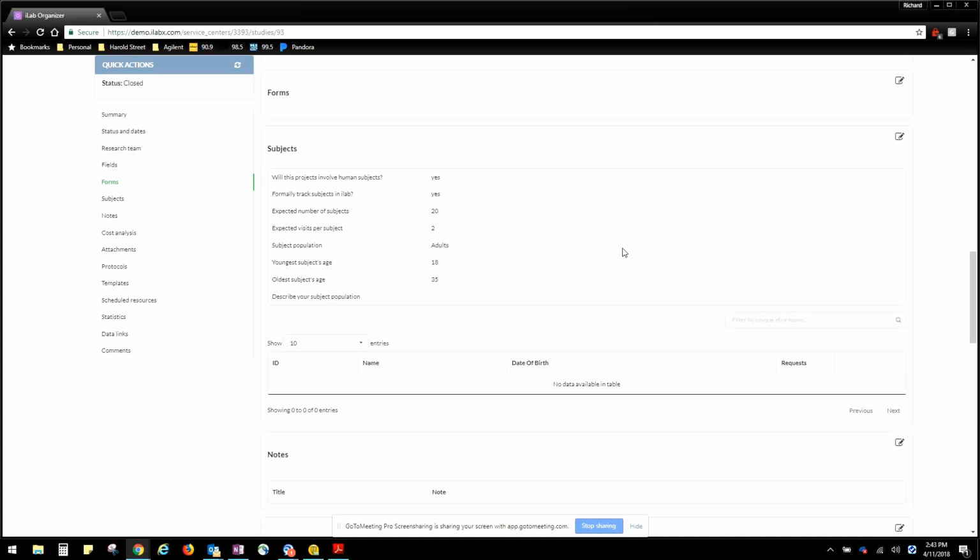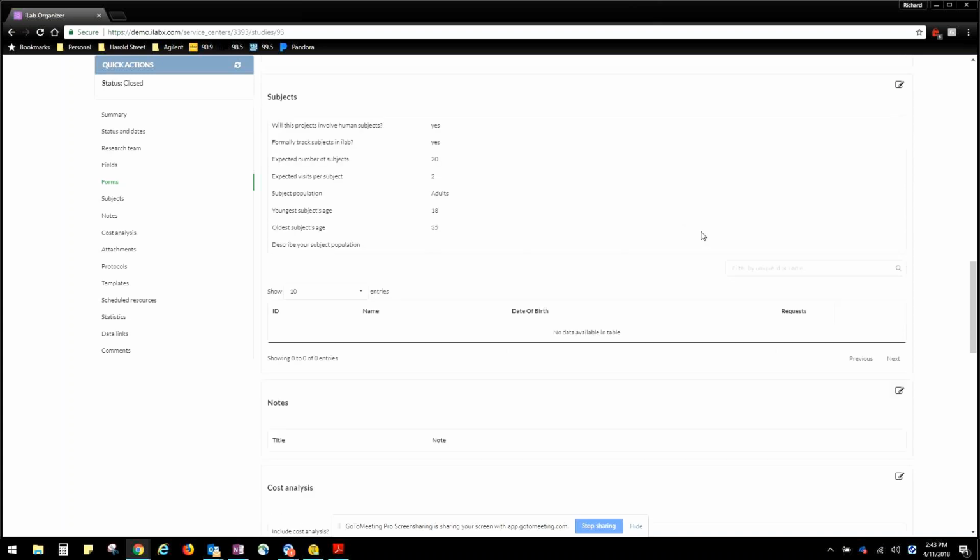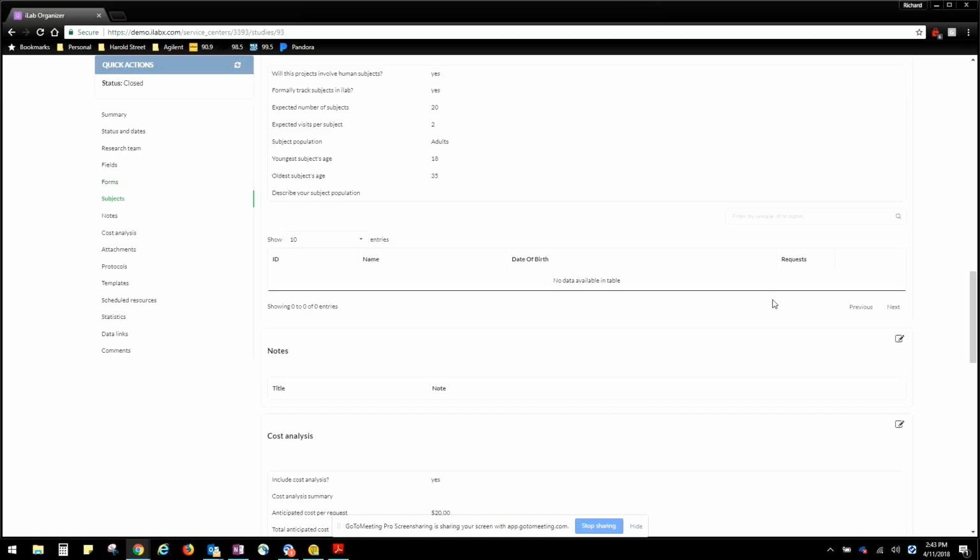So, Misty, if we do end up having a clinical core that has PHI relevant info contained, we're going to probably have to have a conversation offline of how iLab works with PHI info, and what mechanisms, whether that's a contract or some type of agreement, we would need to have in place to make sure we're crossing all the appropriate ducks off there.